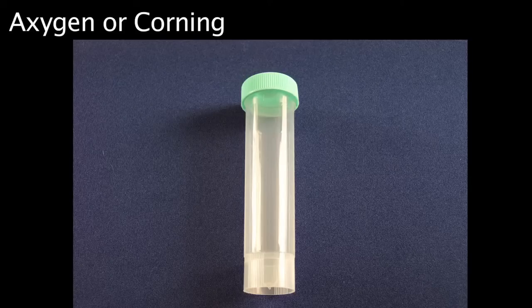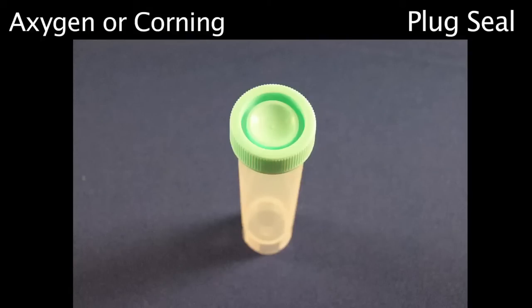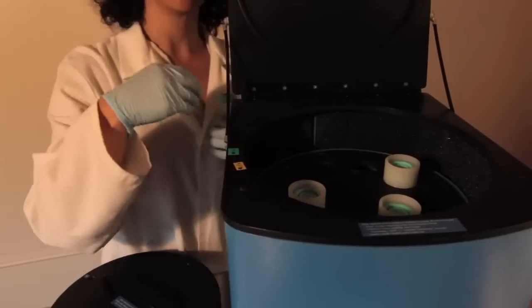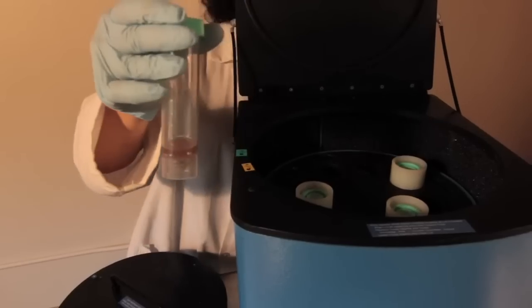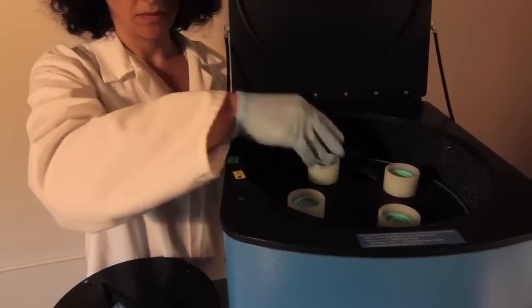The Bullet Blender 50 DX uses 50 milliliter self-standing Axigen tubes or Corning tubes. Make sure that the tubes you're using have plug seal caps. You can tell if the cap has a plug seal if there is a circular indentation on the top of the lid — this type of cap creates the tightest seal. Also, when using the Bullet Blender 50 DX, make sure that the tube is placed inside of a protective sleeve prior to loading it inside of the instrument.